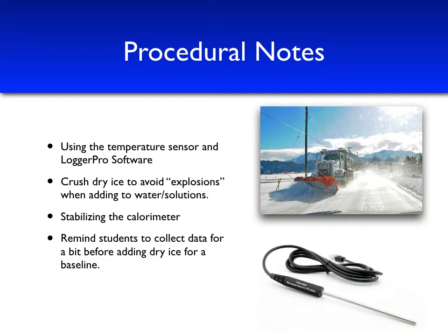But for now, remember that the temperature sensor must be plugged into a LabQuest Mini, which serves as an interface between the computer and the sensor itself. In LoggerPro, we'll be using what's known as time-based measurement, where a temperature will be measured for every increment of time as indicated in our data collection mode setup.